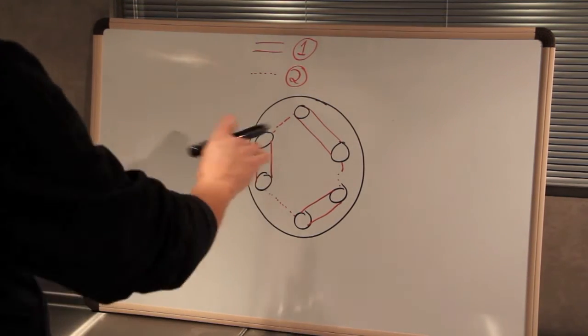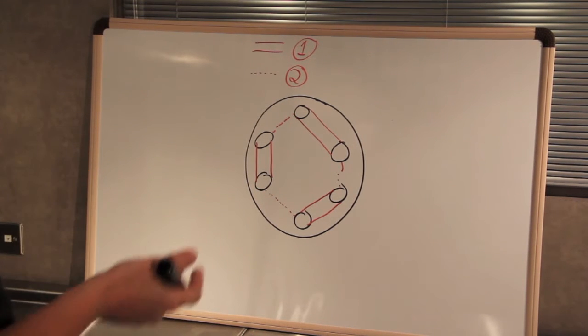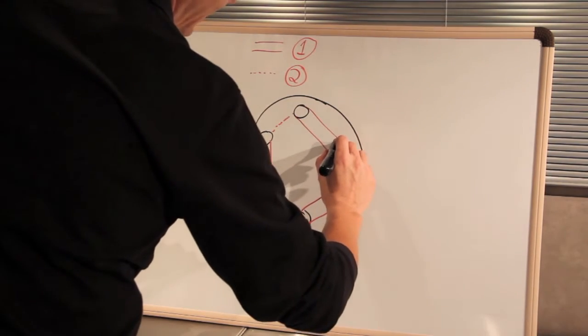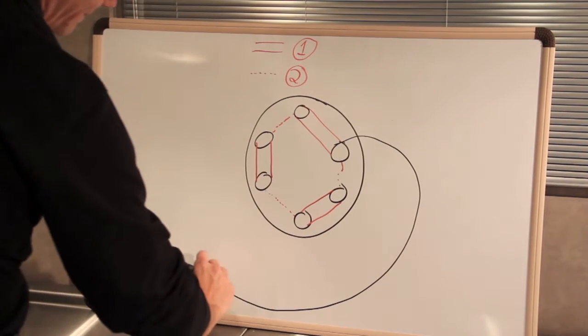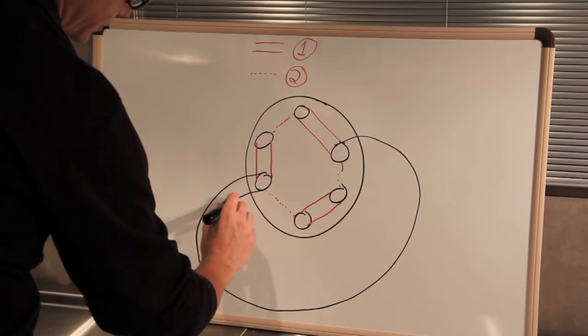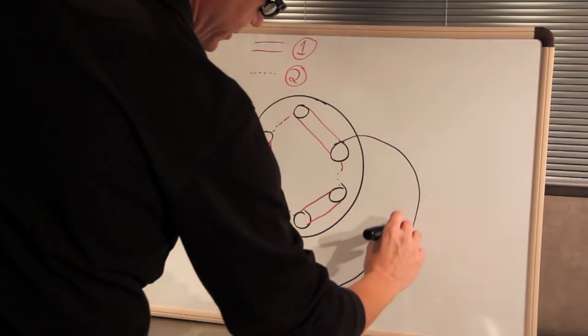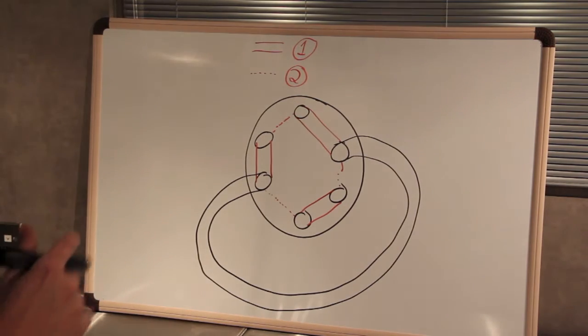Right now we're going to say position one is actually our sample loading position. So we're going to draw in the sample loop and the sample loop simply goes from a port on one side of the valve to a port directly opposite. Now it really doesn't matter which ports you use for this. It's important to understand how it works.